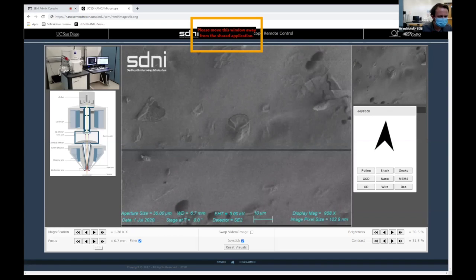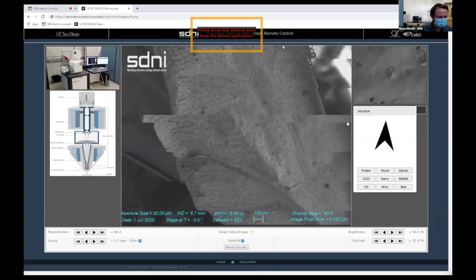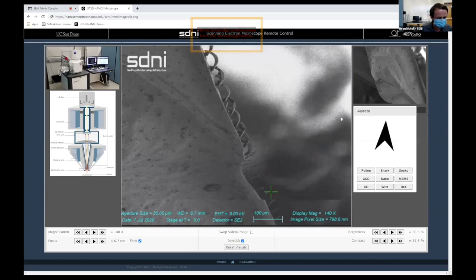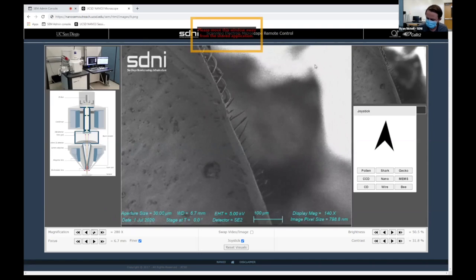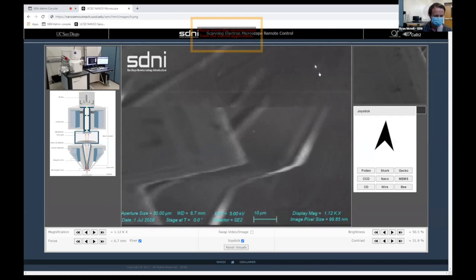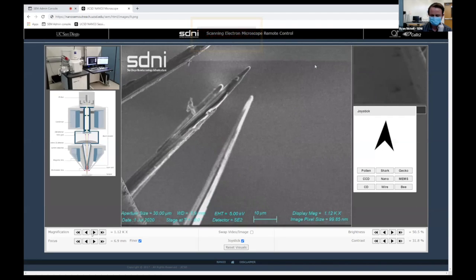I do want to maybe move up to the edge. I'm going to zoom out a little bit. The edge, often you can see it a little bit better because of the angle. You can see the hairs on the edge of the wing here. Whenever you look top down, you don't get the perspective sometimes, so it's a little bit easier to see over here. You can still play for the last couple of minutes, and if there's any other questions before we hand over to the AFM. June looks like he's very proficient at figuring out all the buttons. You're very fast.